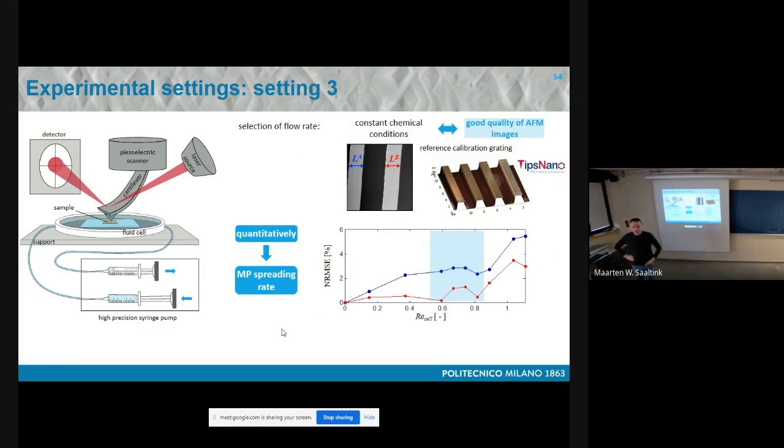Please. Question, yeah, and very nice presentation, by the way. You mentioned that you measure relative rates using the setup that you've done so far. Can you say something, or can you deduce maybe from your last experiment something in terms of absolute rates and what it means in terms of changing the solution composition? Because you're injecting in stepwise mode, so you put some solution in place, and you do a scan, right, and then you change the solution again, and so on.